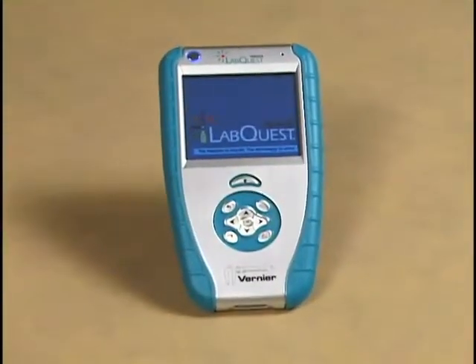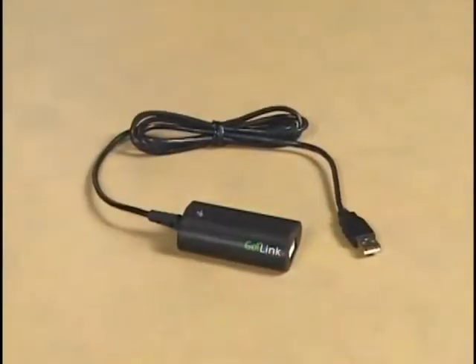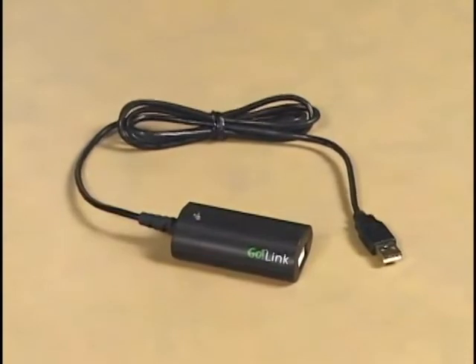So why should you use Vernier probeware? I'll start with hardware. We have a collection of over 60 sensors which we've developed over many years, and those sensors are great because they can be used in so many different ways. You can use them with our top-of-the-line LabQuest interface or with our inexpensive Go-Link where you plug into the USB port of a computer.